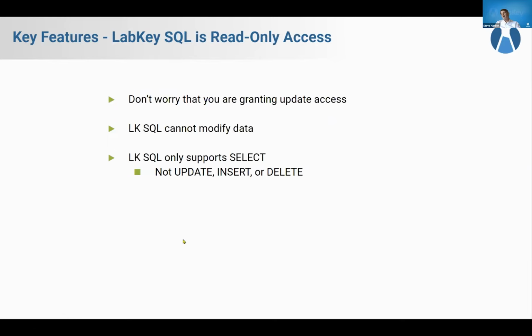And again, just to repeat, LabKey SQL is explicitly a read-only language. You don't have to worry about your users inadvertently updating or inserting or whatnot when they're using LabKey SQL. You use other mechanisms in LabKey to do that, like the web UI or the API or whatever, but not LabKey SQL.